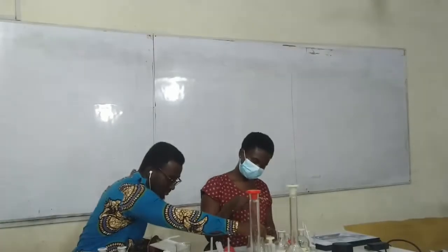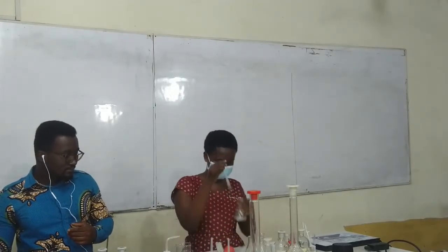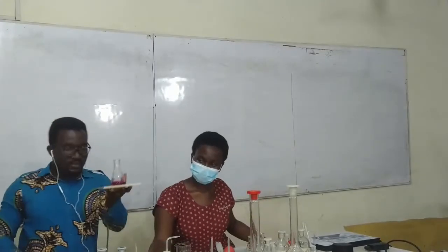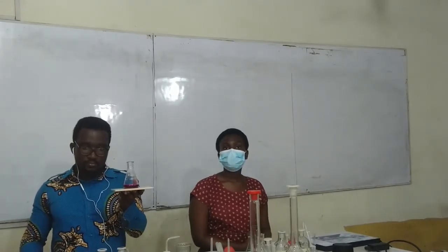Madam, continue with the other solution. The same solution, solution B. This time, you are going to add some few drops of phenolphthalein. Good. So, she added only 2 drops. You can pause the video and then guess what color this is. If your guess is that the color in here is deep pink or pink, then your guess is right. Meaning you are correct.